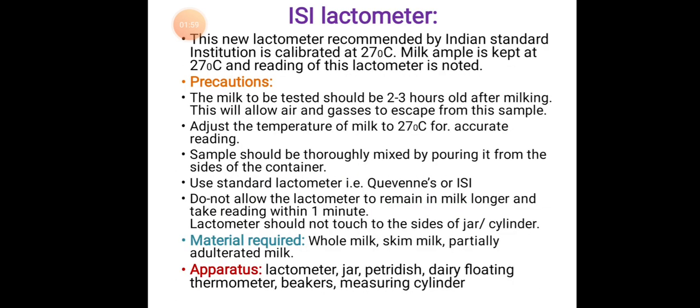ISI lactometer. This is the new lactometer recommended by the Indian Standards Institution, calibrated at 27 degrees Celsius. The milk sample is kept at 27 degrees Celsius and the reading of this lactometer is noted.